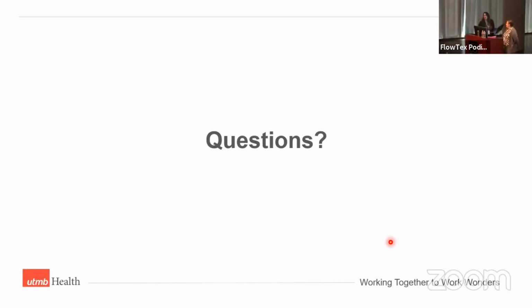I'll just repeat it here, although Rui's already fielding your questions online. Is there any recommendation on calculation of dim fluors using either stain index versus separation index?